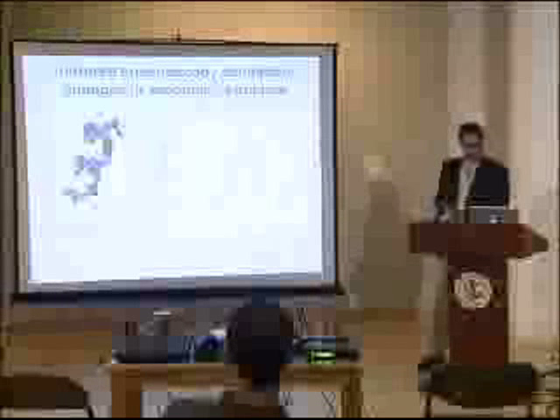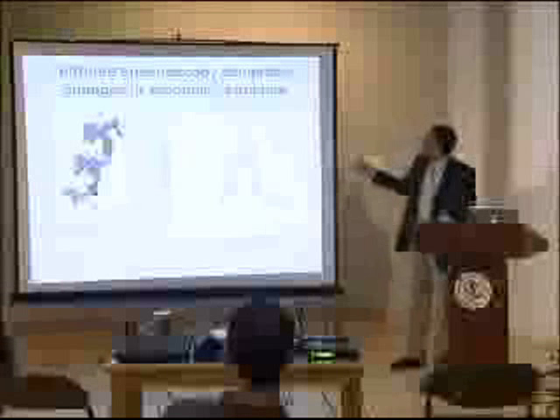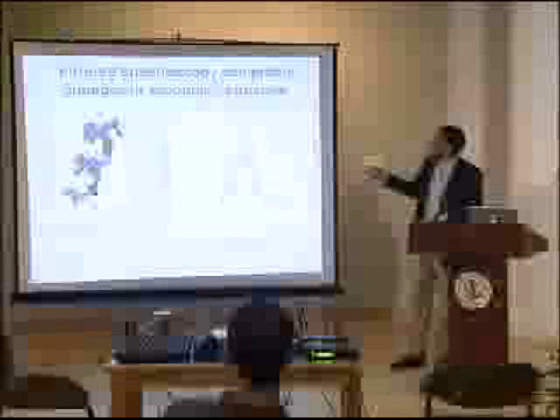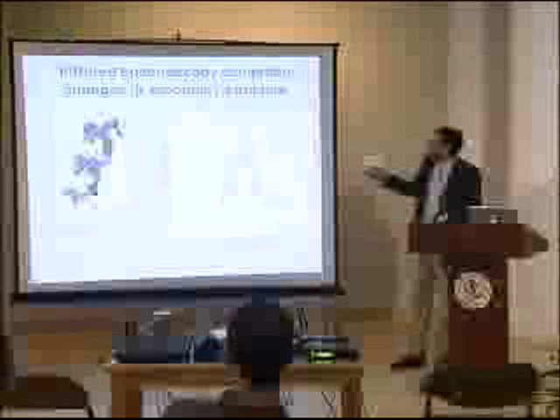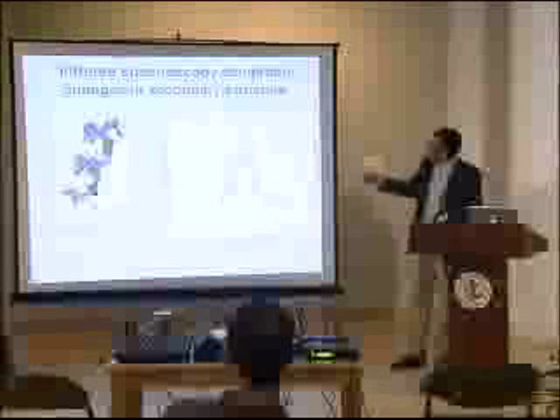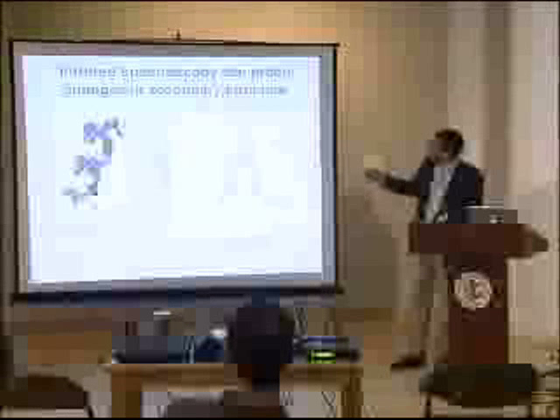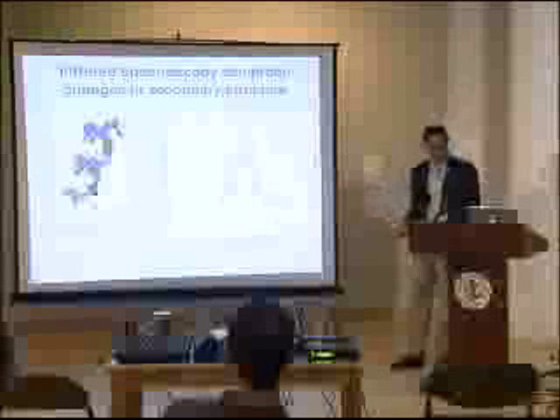To give you an idea of the type of change, if we have a simple protein that changes when we heat it up, at low temperatures it has one shape, we heat it up and it goes to another shape, and we can follow that change in shape by looking at this change in the spectrum, the change in this peak, moving from one position to another.